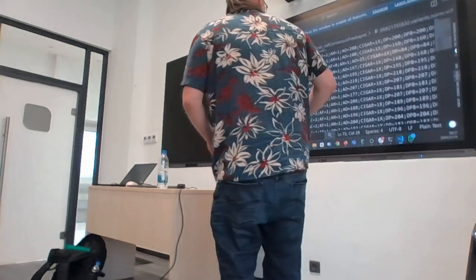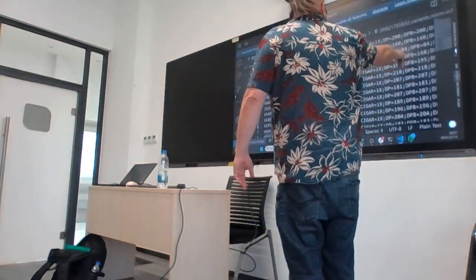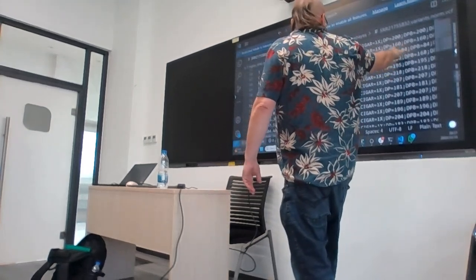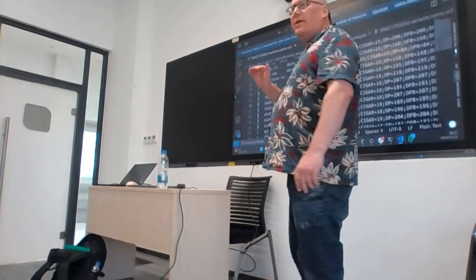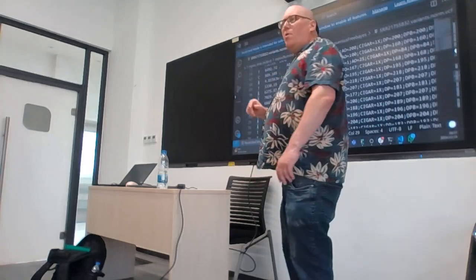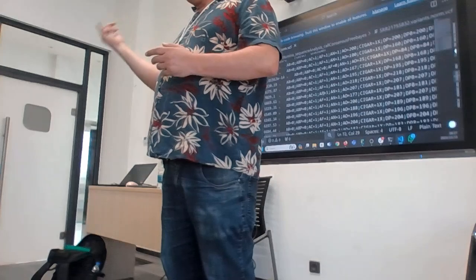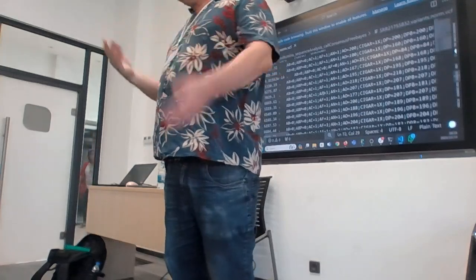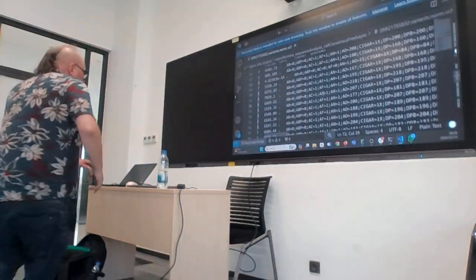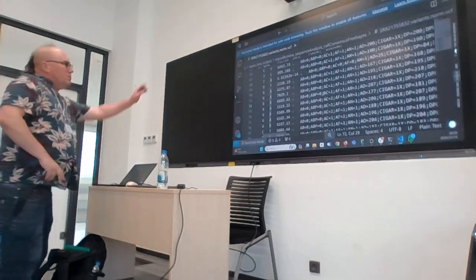And then over here, there's a variant called, but depth here is 84, much lower depth, and AF is 0. So almost none of the reads. It's obviously rounding it, but maybe it was 1 read or something like that. Almost none of the reads are supporting this variant over here. This one where it goes from a T to an A.